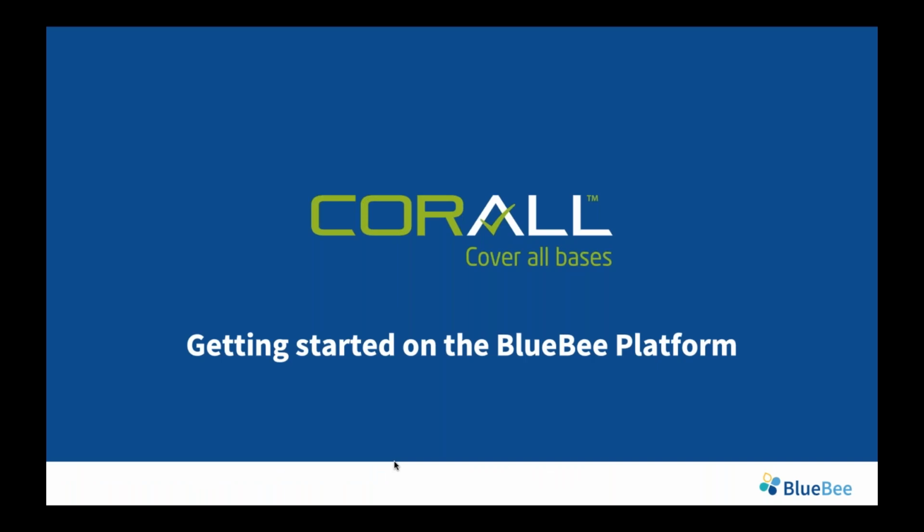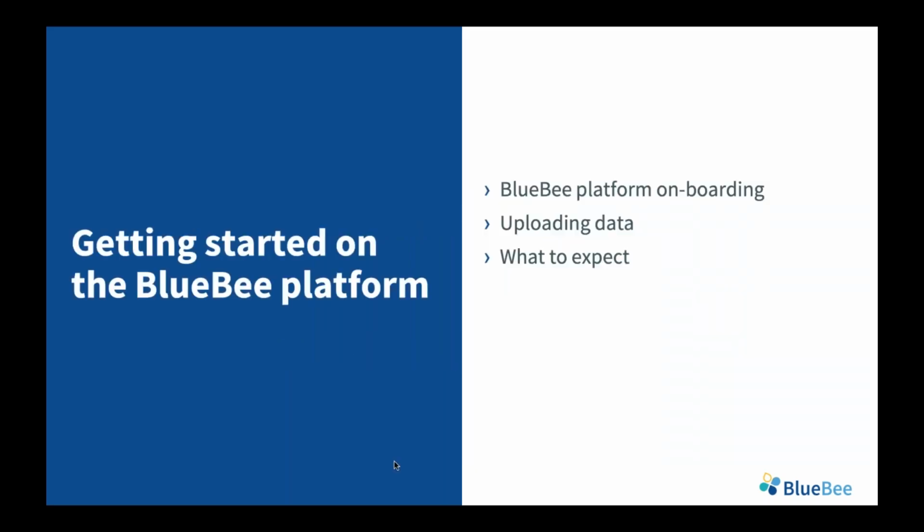That brings us now to CORALL, the new pipeline on BlueBee platform. I'll give you a short introduction on how to register on the platform, how to create and manage projects, uploading data, start a run, and what results you actually get at the end.